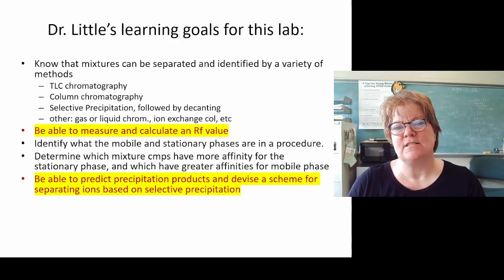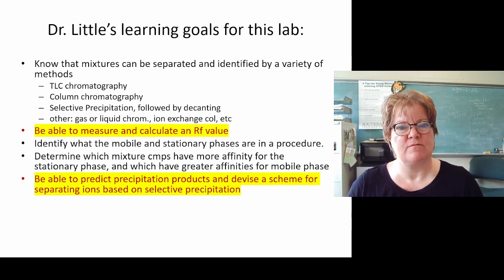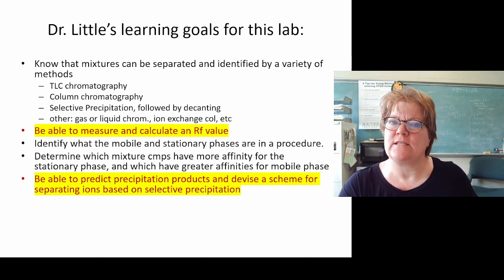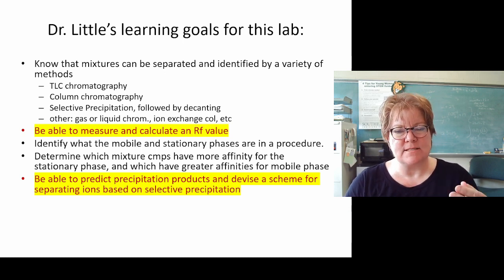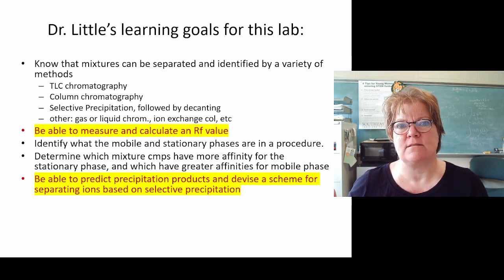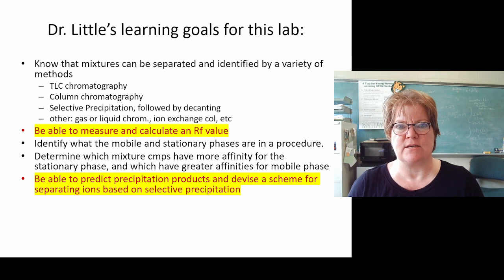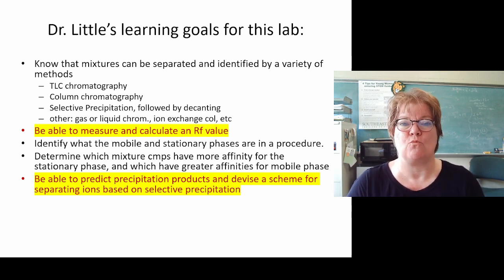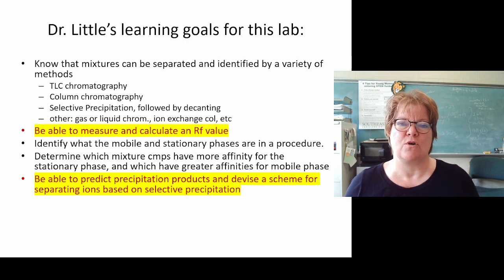So in the analysis part of the separations lab, we're focusing on a couple of these goals that I had. Some of these goals we already did in the experimental portion, but in this second part, it's can you be able to measure and calculate an RF? So we'll just practice going over that a little bit. I know you got a little confused with how to process it and which dots to use. We'll go through an example.